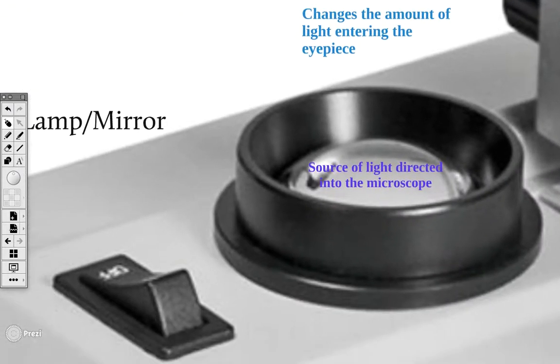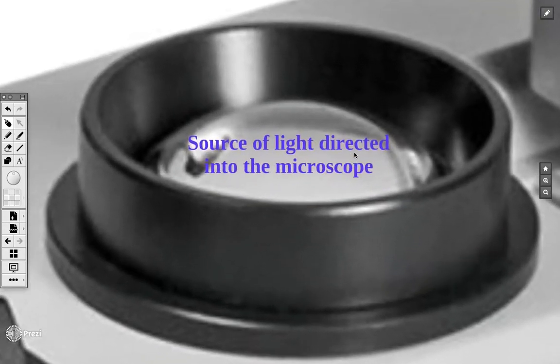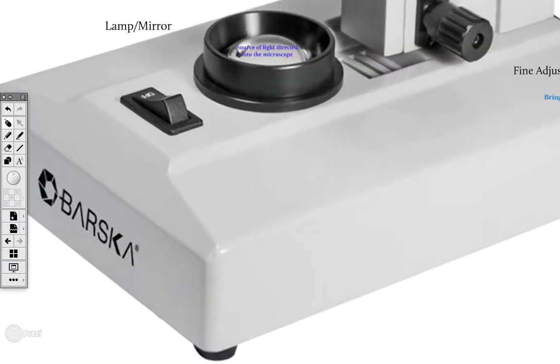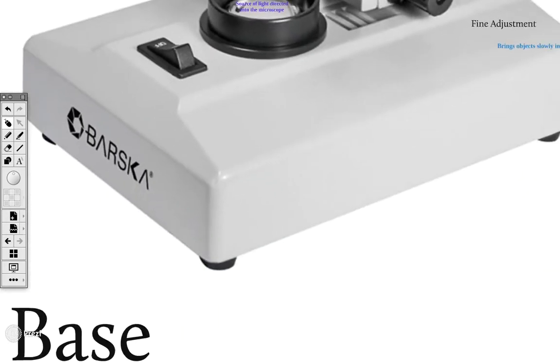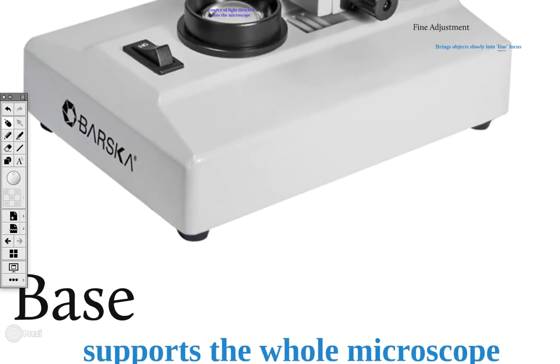Again, that's the diaphragm. Moving on from the diaphragm, we have our lamp and our mirror, which is at the very, very bottom of the microscope. And this is that source of light that gets into the microscope. You will always have to turn it on using this little knob right here after you plug it in. And that sends the light up into the microscope. Lastly, our last couple of ones, we have our base, which is down here at the bottom. It supports the whole microscope.